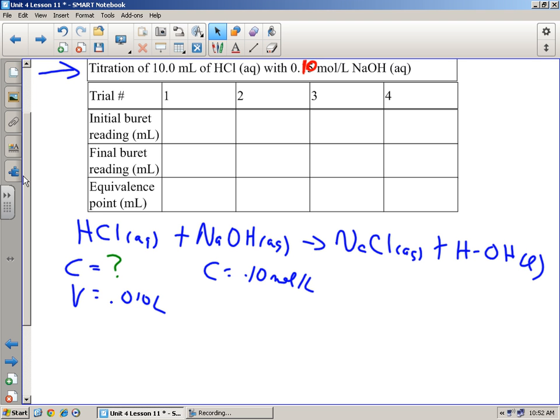Don't put the bulb on it and try to get every last drop out, because it's not going to. It's calibrated that way. If there's a little drop in there, that's fine. Here comes one more, I guess. There. There might be a little bit left in there. Don't forget that's how it's calibrated.